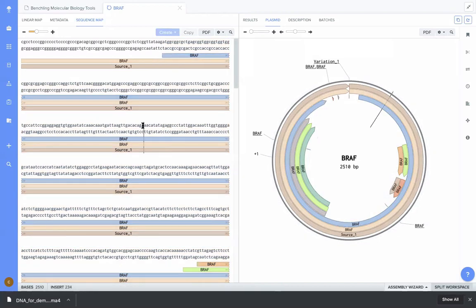Benchling's editing features are super intuitive. For example, I can just click directly into a sequence and make an edit, and you'll see that those changes update automatically on the sequence itself. So I highly encourage you to play around with the molecular biology tools if you haven't already.